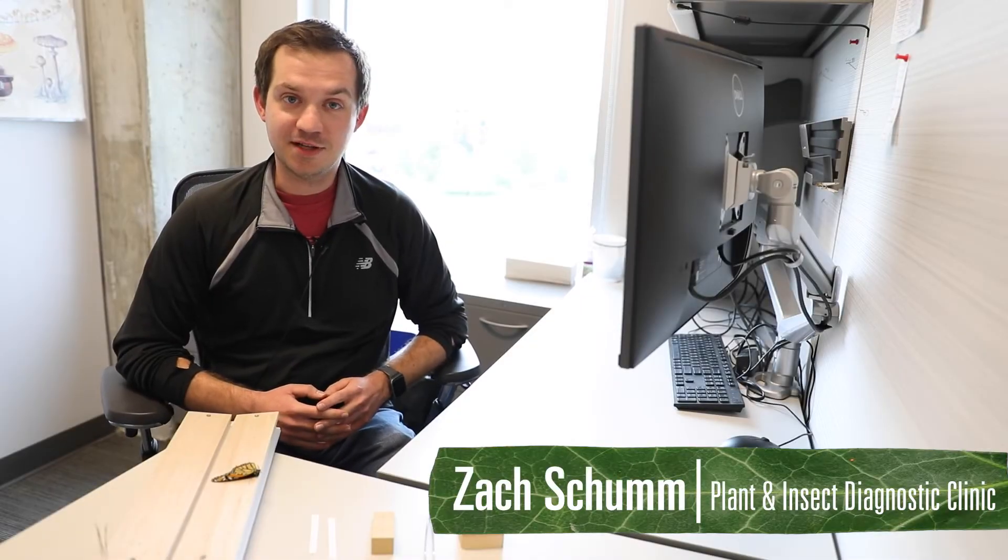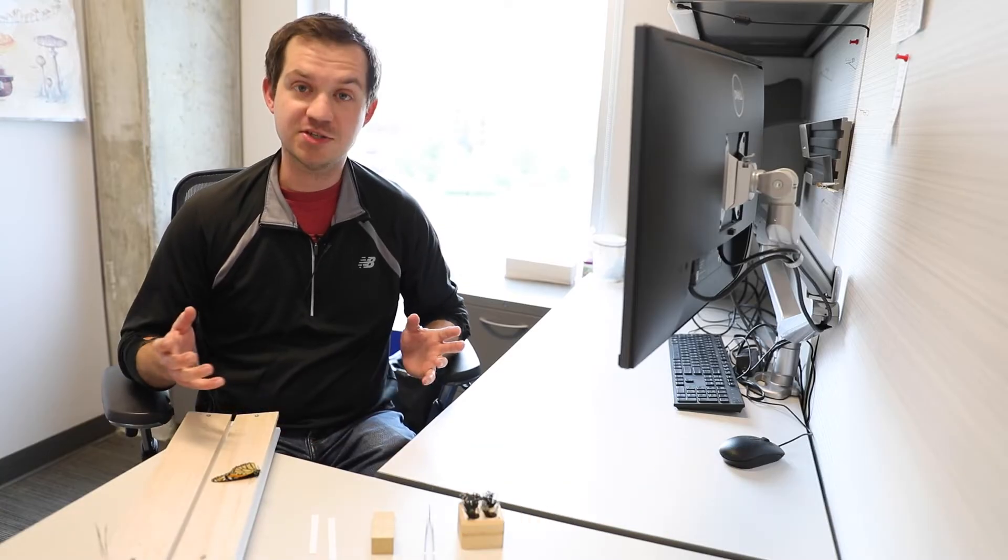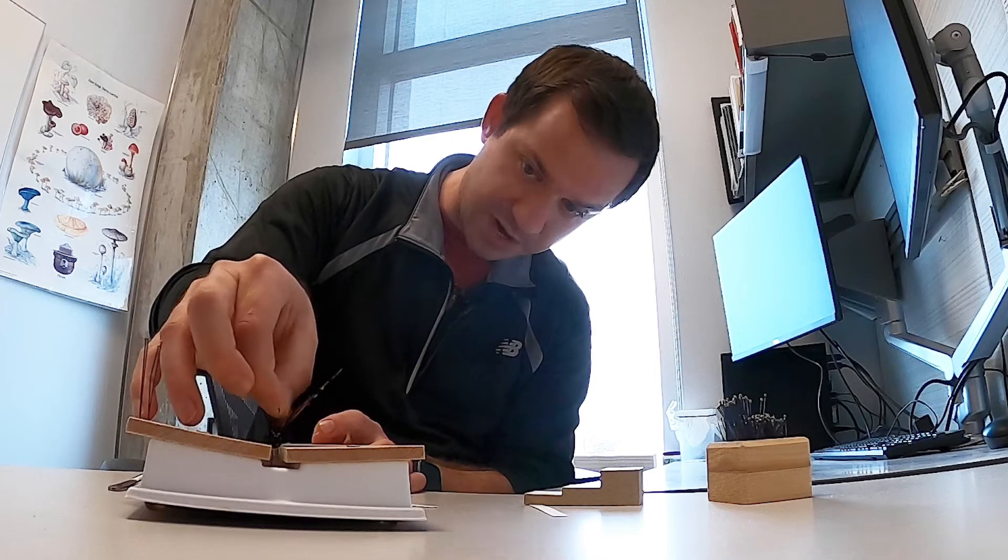Zach Shum here with the Iowa State University Plant and Insect Diagnostic Clinic, and today I'm going to show you a very basic way on how to pin a butterfly and spread a butterfly.